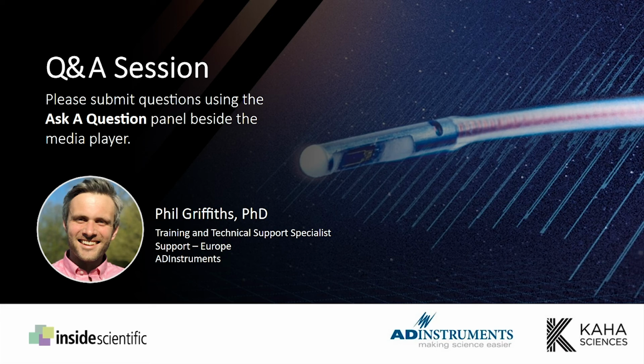Yeah, that's a good question, common question as well. The short answer is no. And we've got some data that we collected a few years ago to support that as well. But basically, the wireless power technology is quite smart, and the field generated by the smart pad and the T-base is optimized based on feedback from the telemeter.